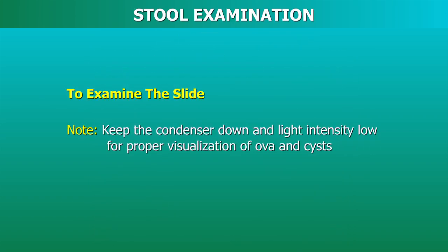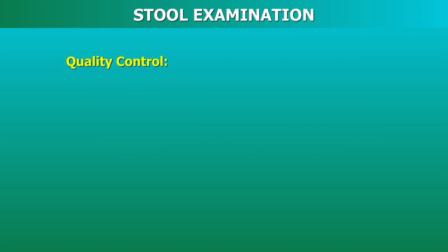Note: it is preferable to keep the condenser down and the intensity of the light low for proper visualization of the ova and cysts. Quality control.